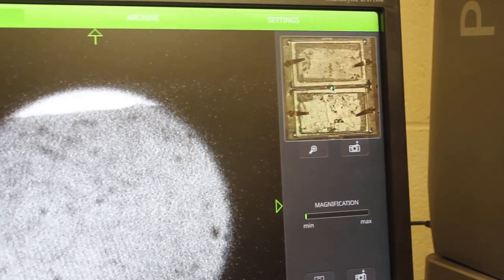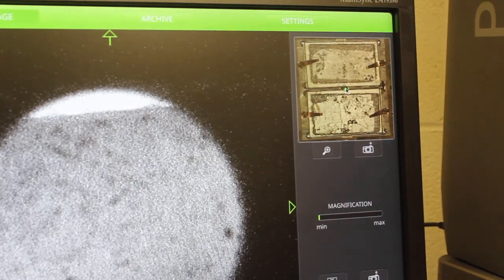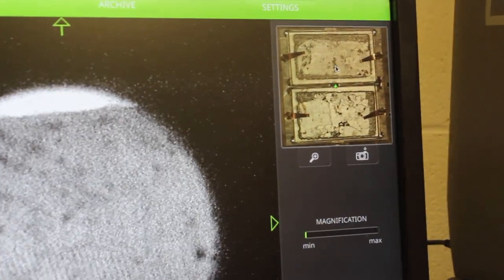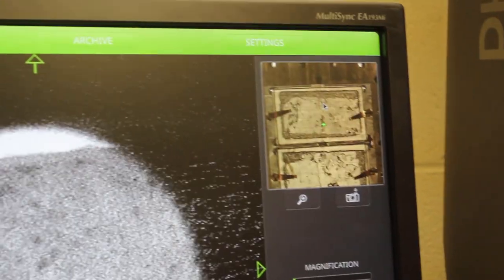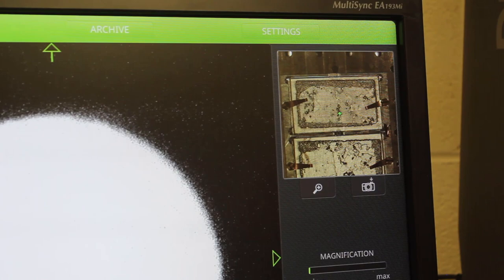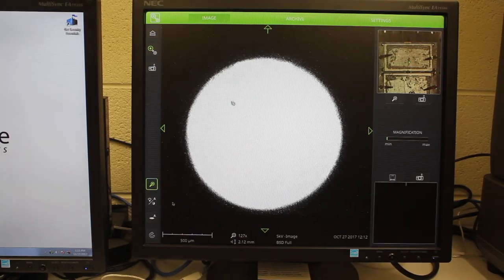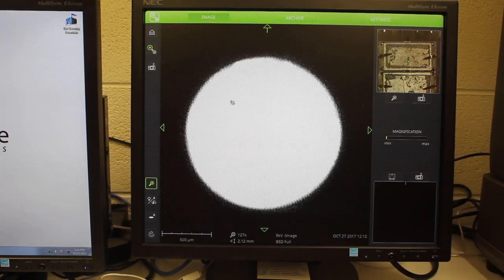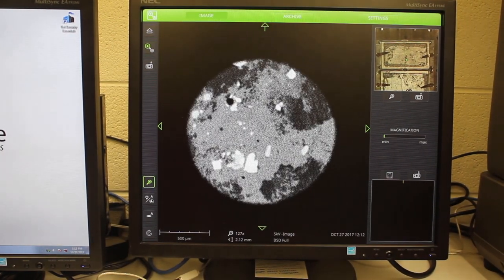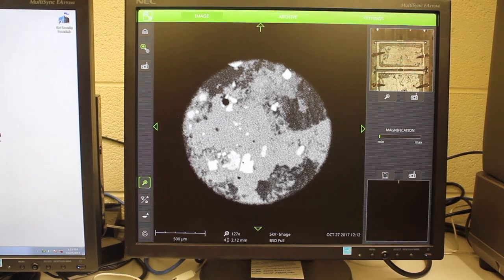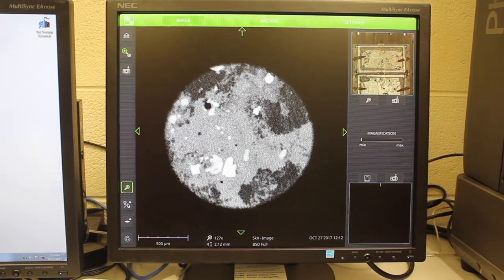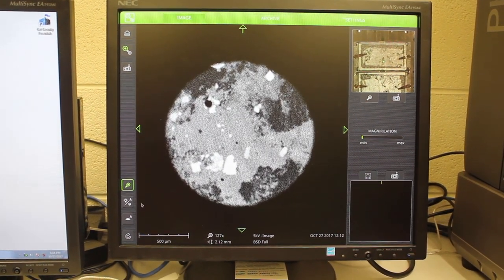Once you insert your sample into the SEM, you should navigate to a point you want to analyze using the top right image. Now we can see that the image still isn't great, so we're going to do an auto brightness and contrast, which is the second button on the left side, so we can see some of the grains.